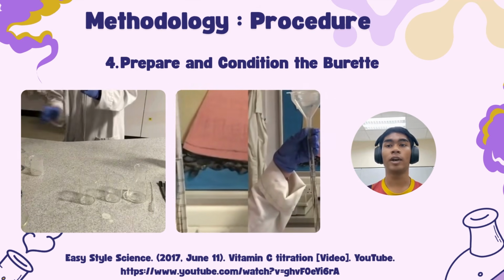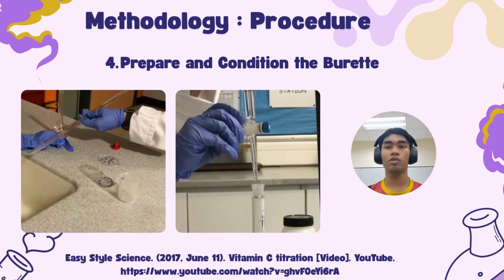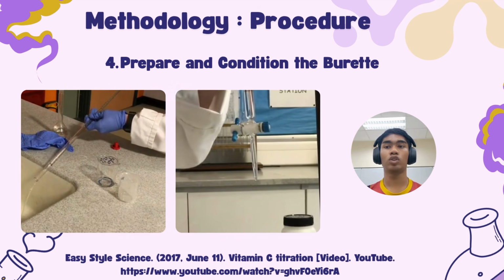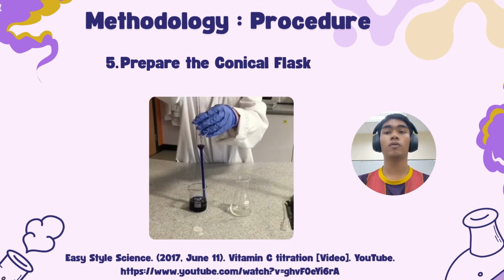Rinse the burette with a small amount of the prepared vitamin C solution, inverting it to coat the sides, and then dispose of that solution. Fill the burette with the vitamin C solution to a point above the zero mark. Allow the excess solution to flow through the tip until the bottom of the meniscus rests exactly on the zero graduation.